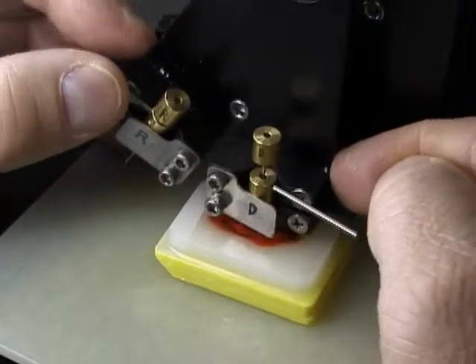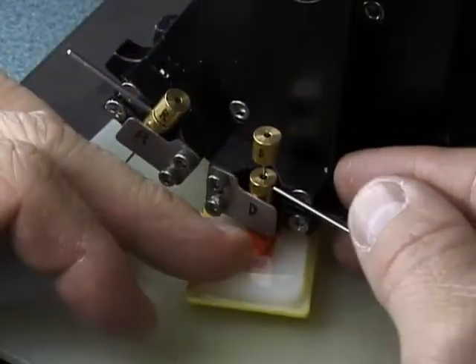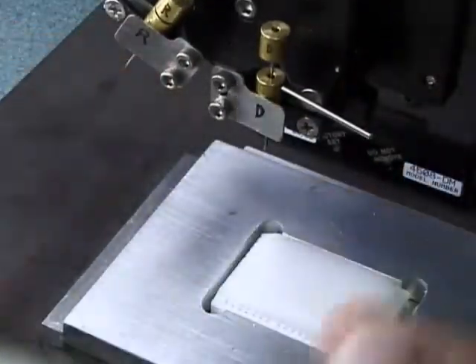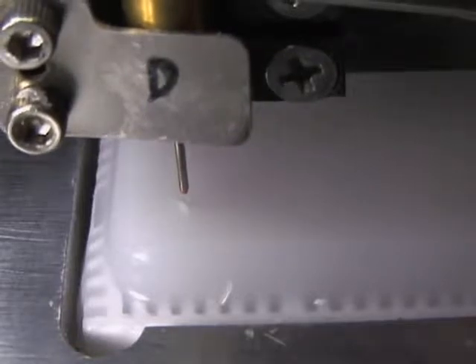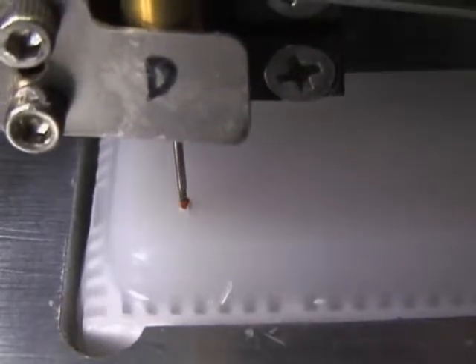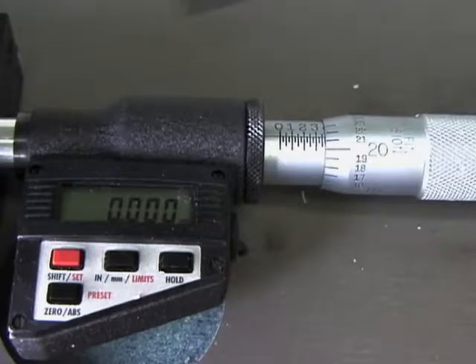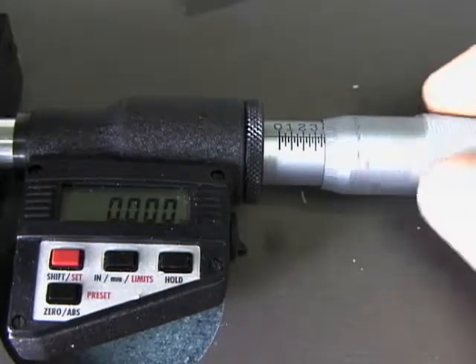Set the donor block bridge on the arrayer. Since the depth stop only works with the array or recipient block, you will need to take care not to punch too deep or you will damage the donor needle. To insert a punch, place the donor needle just above the hole in the array block. Slowly and carefully push the core out of the needle. This may take some practice, since it deals a lot with hand-eye coordination.